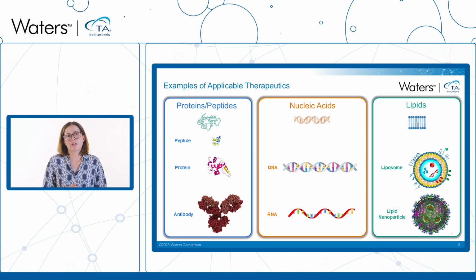This is an introduction slide to the modalities that can be studied using DSC. And these are proteins, nucleic acids, lipids. However, in today's presentation, we are mostly focused on protein applications.